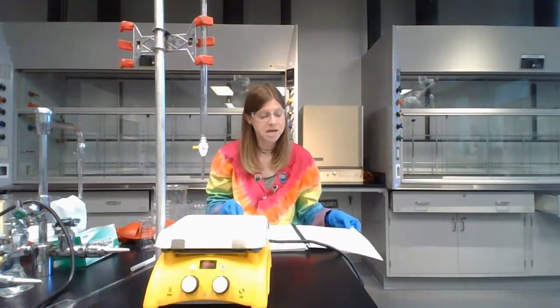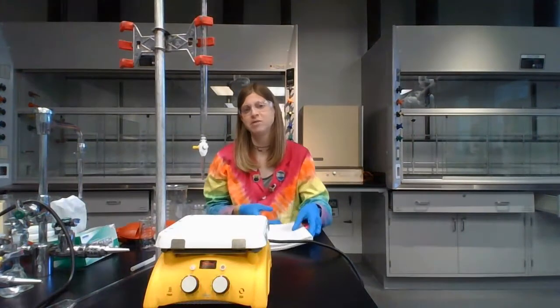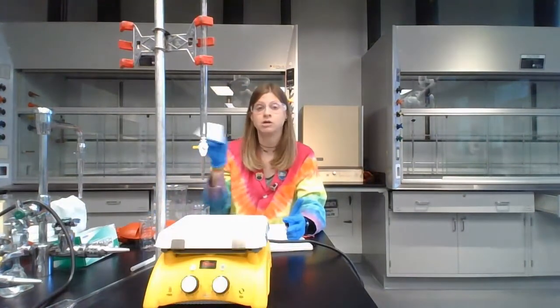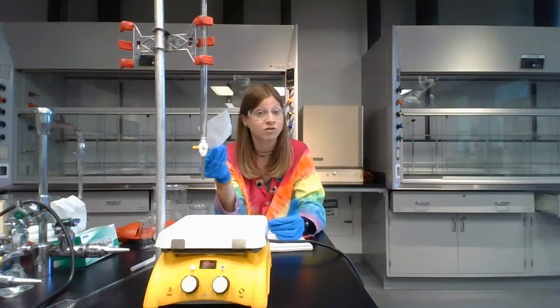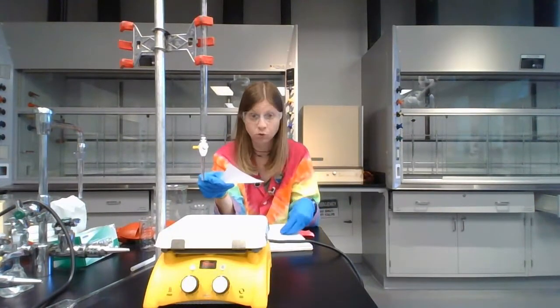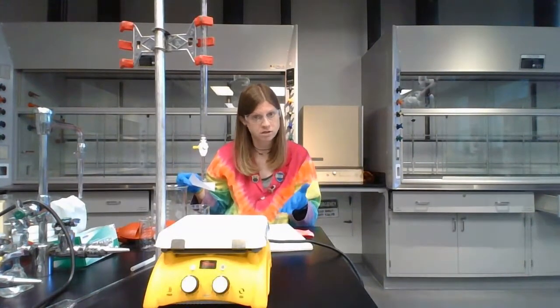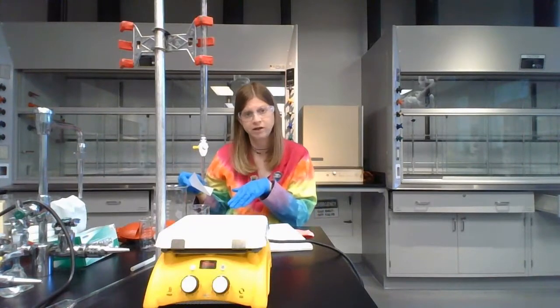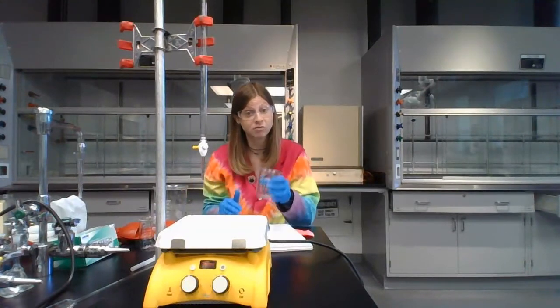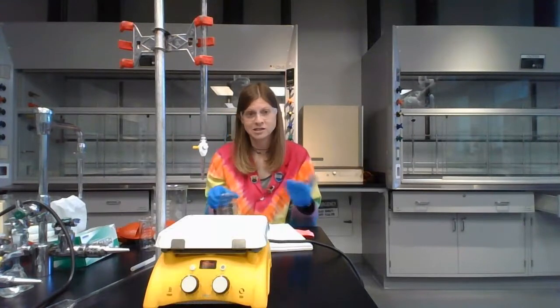Part B, the only difference in part B is the solid that you're measuring out. So instead of measuring out 0.1 to 0.15 grams of sodium oxalate on your weight paper, you're going to measure out 0.5 grams of whatever unknown number you were assigned. It will be a solid. So you're going to measure out 0.5 grams and accurately record that. Pour that into your beaker for trial 1 of part C. Rinse it with the 100 milliliters of sulfuric acid. It needs to get to a temperature of between 70 and 90 from the hot plate before you can start. Once you're ready, add the stir bar, add your potassium permanganate until we get the light pink color.